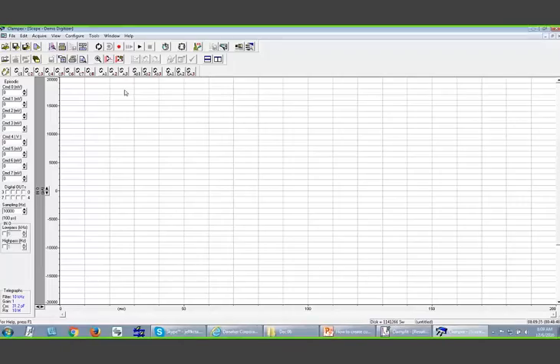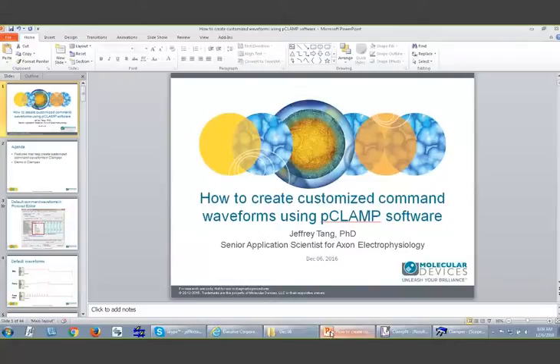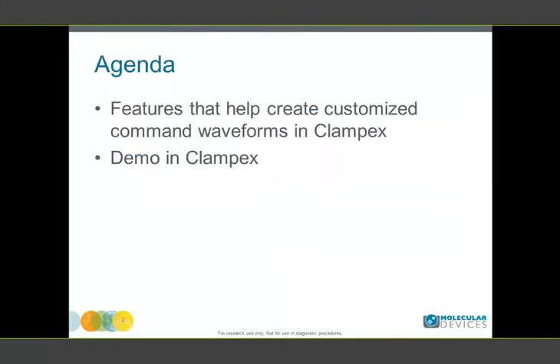All right. Thank you for the introduction, Jeffery Weber. And now let us start today's presentation. So let me get into presentation mode. The title of my talk, as Jeff Weber already mentioned, is how to create customized command waveforms using pCLAMP software. Now here's my agenda. I will introduce features that help create customized command waveforms, and I will perform a live demonstration using Clampex.